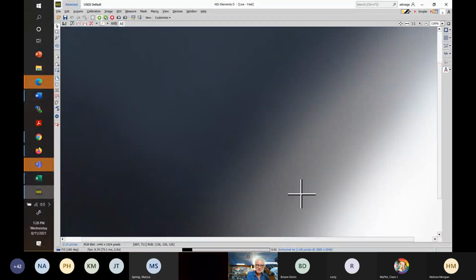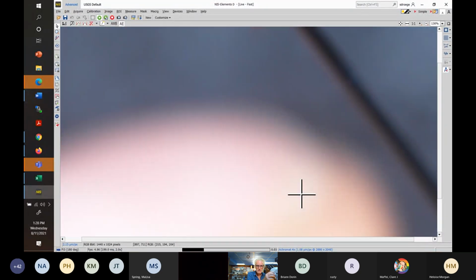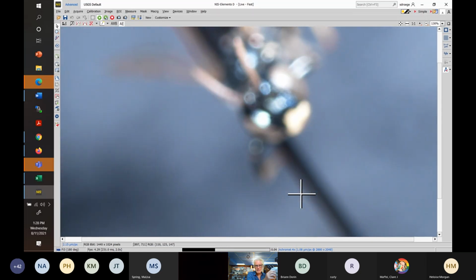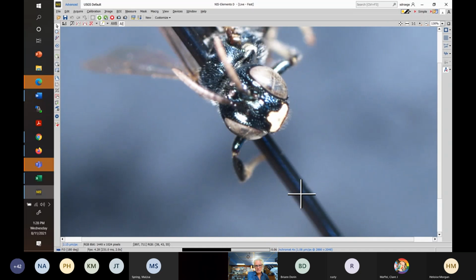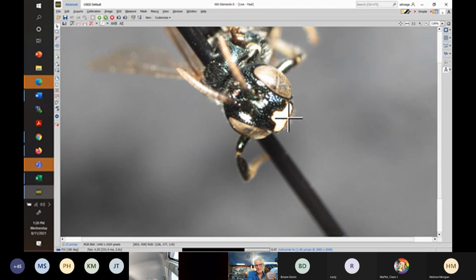Here to illustrate the T-shaped part of Ceratinas, get that in focus, and maybe white balance. Okay, this T-shaped thing very clearly says it's a male. You can look at other features too. Sometimes in Calcarata, this is also reduced, but many times it's like this. It's full-blown. It'll be exactly the same look in McMackey.